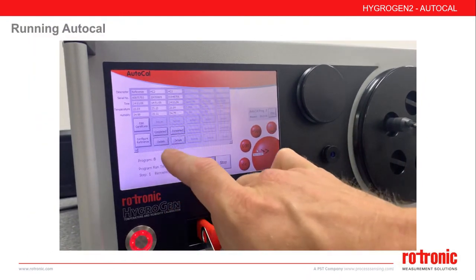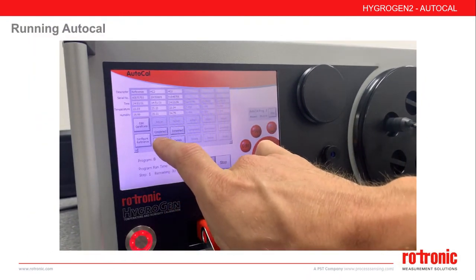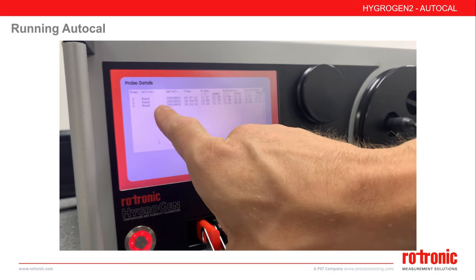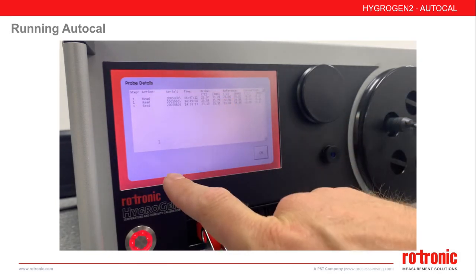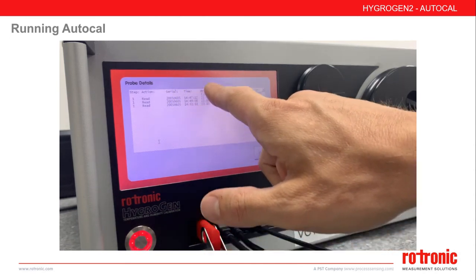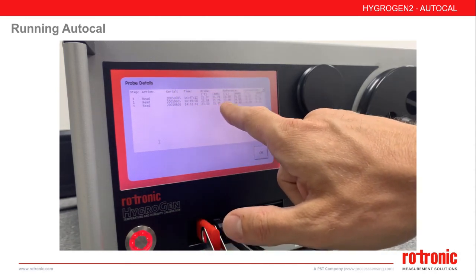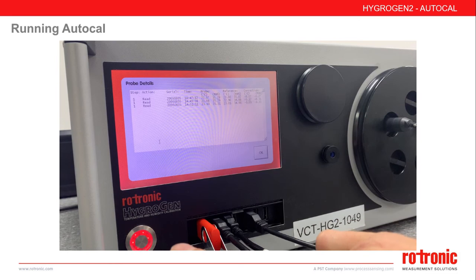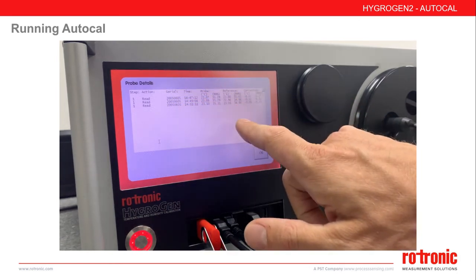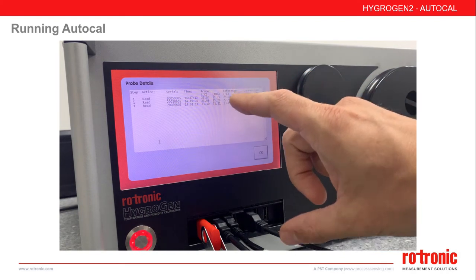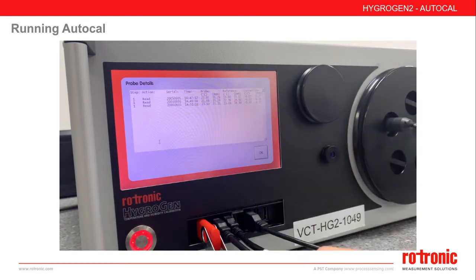During an AutoCal program, you can review details for each probe via the details button. The probe details table lists all the steps and actions for that probe. Here we can see that during step one, the probe has read three times, including the time of the reading and the probe and reference details. By default, AutoCal will record five readings per step, which allows you to show stability over at least 10 minutes. All this information is included in the final certificate.